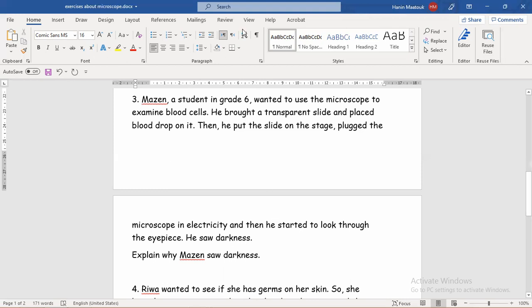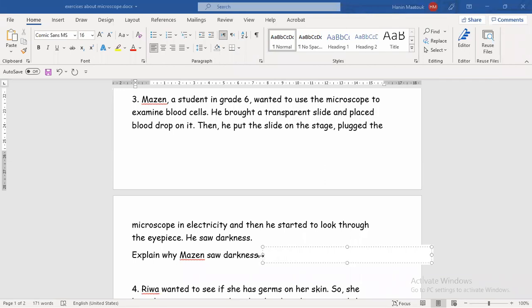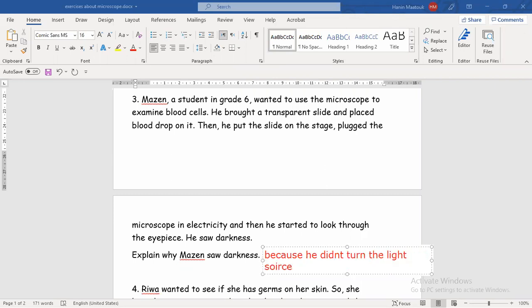This question shows the importance of the light source in the microscope — it enlightens the object and reflects its image so we can see it. So why did Mazen see darkness? Simply because he did not turn on the light source. You can also say there is no light in the microscope, so no light means we will have darkness. This question highlights the importance of the light source, or lamp.